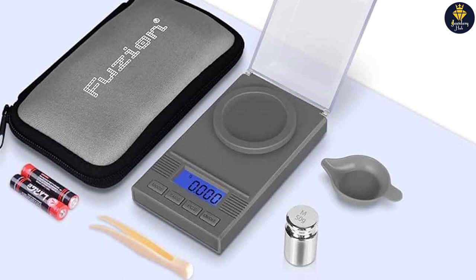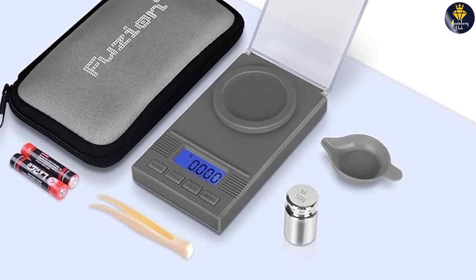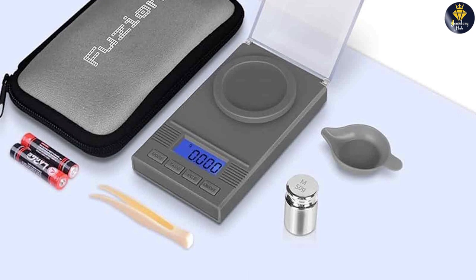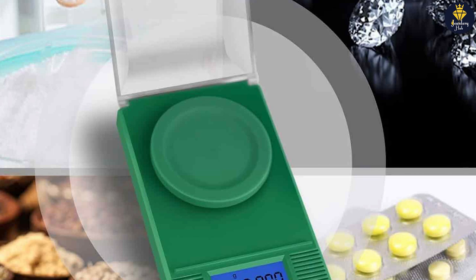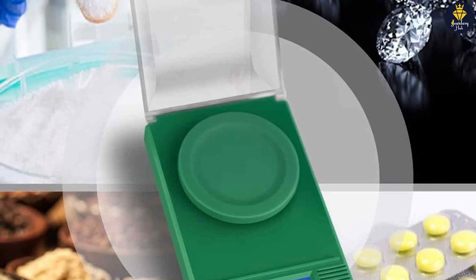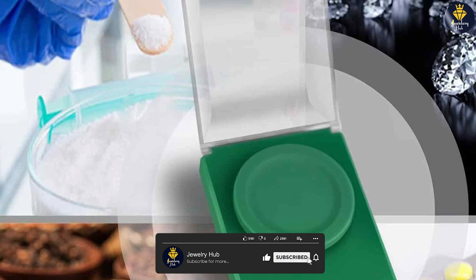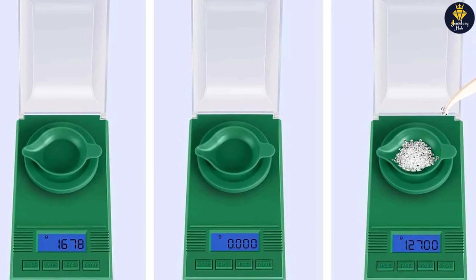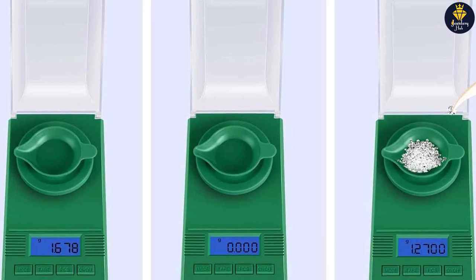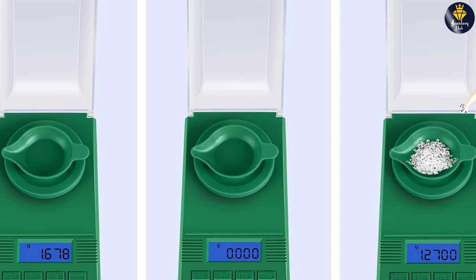Overall, the Fusion Digital Milligram Scale PL50 is a reliable and accurate scale that is well-suited for various weighing needs. Its high-precision sensor, multiple weighing units, and convenient features make it a valuable tool for jewelry makers, scientists, and herbalists alike. Whether you need precise measurements for small quantities or substances, or want to ensure accurate ingredient proportions in experiments or creations, the Fusion PL50 has got you covered.